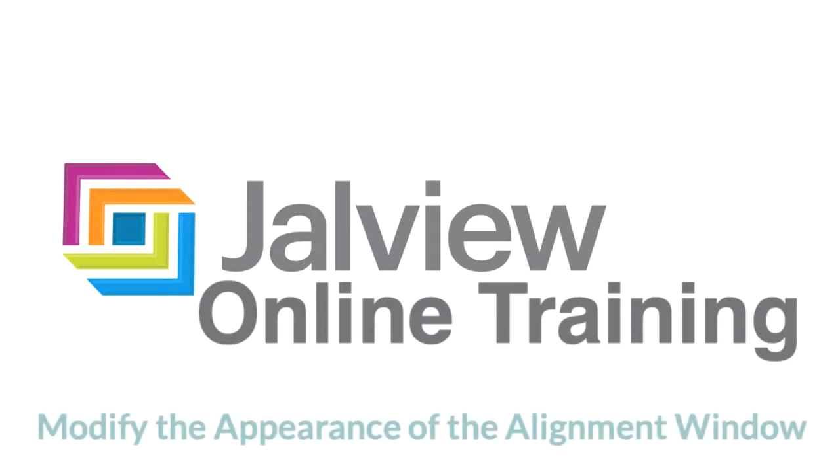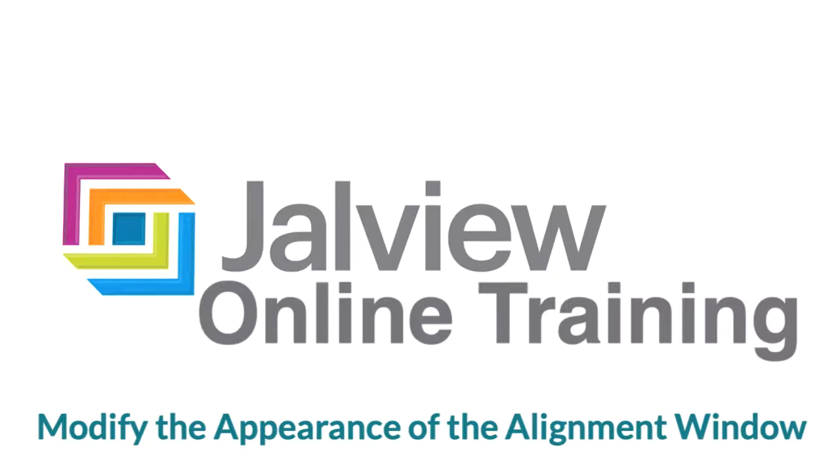In this Jalview online training video I will be demonstrating different ways to modify the appearance of the Jalview alignment window.